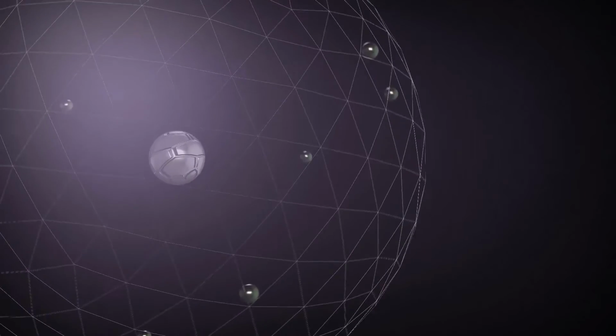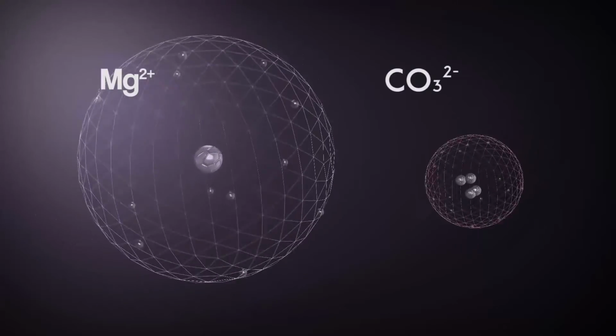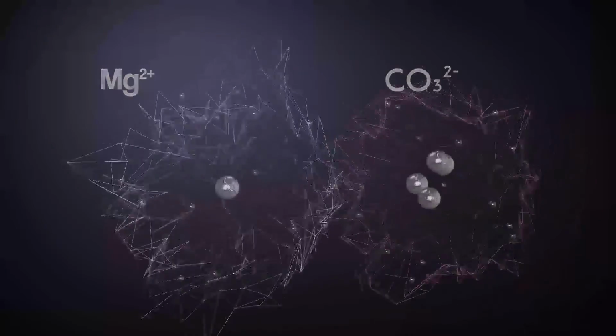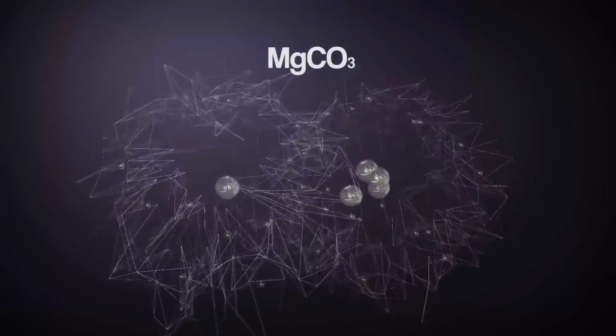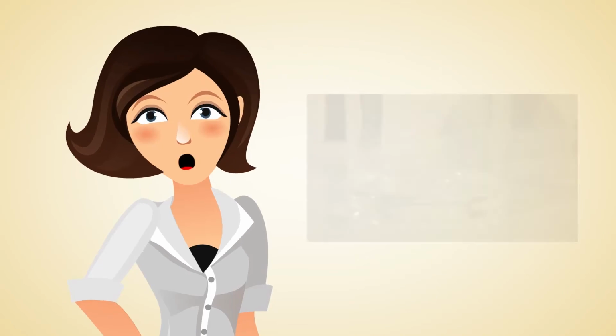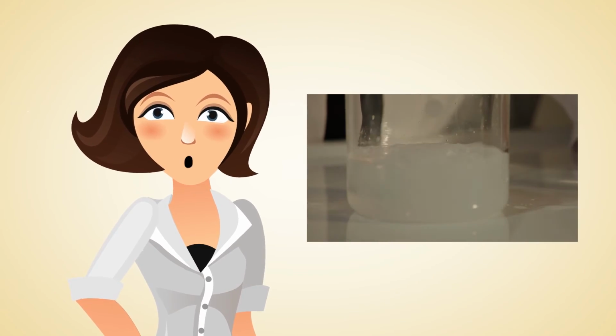In this precipitation reaction, Mg2+ reacts with CO3 2-, and both exchange places with the other ions, Na+ and SO4 2-. Since the new salt is insoluble, a white precipitate of MgCO3 will form.